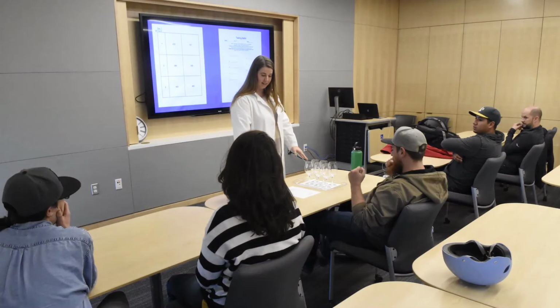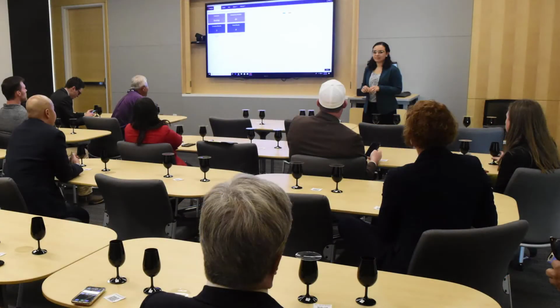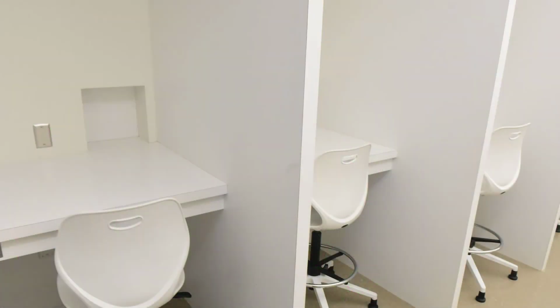Sometimes facilities don't have booths. In those cases, the training area may be used, but it is essential to maintain sufficient separation of space between participants. Booths need climate and lighting to be controlled and to be odor-free. Neutral and non-distracting colors should be used in furnishings and decor.